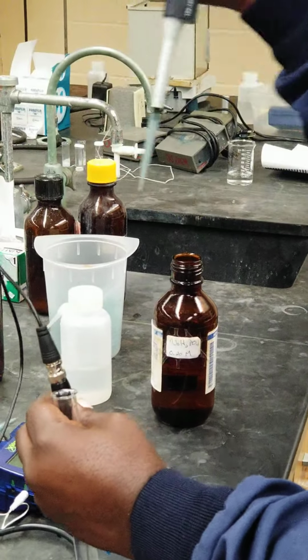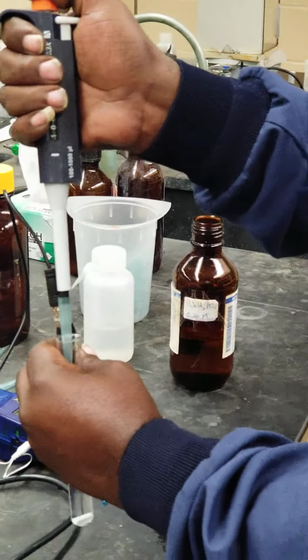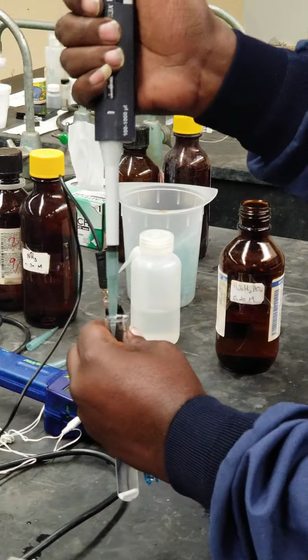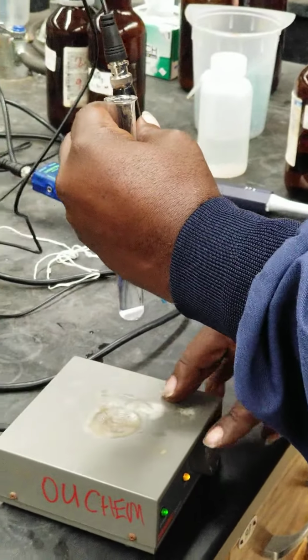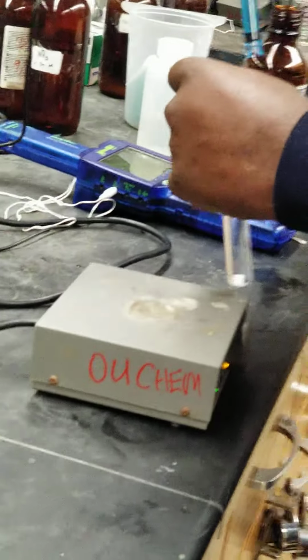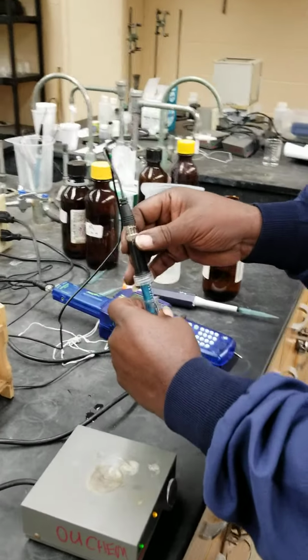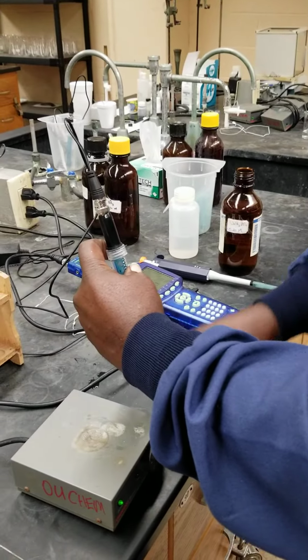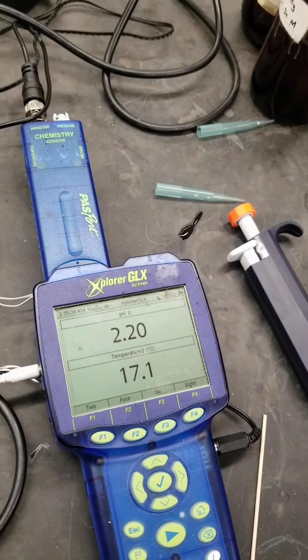One. Two. Three. Nicely mixed. Now read the pH. 2.20.